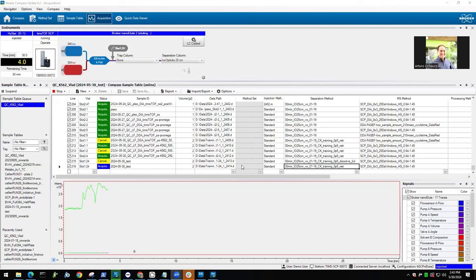No, I added it before I dry the samples. So you could either do it at the end of your protocol, when you resuspend your sample. You could do that with 20 millimolar ascorbic acid in the pipe, something like that. You reduce it, and then dry it out. Okay. Talk with him. If we get our salt, we could have.